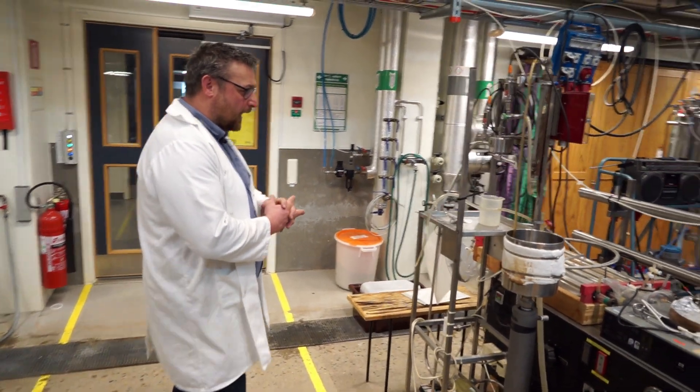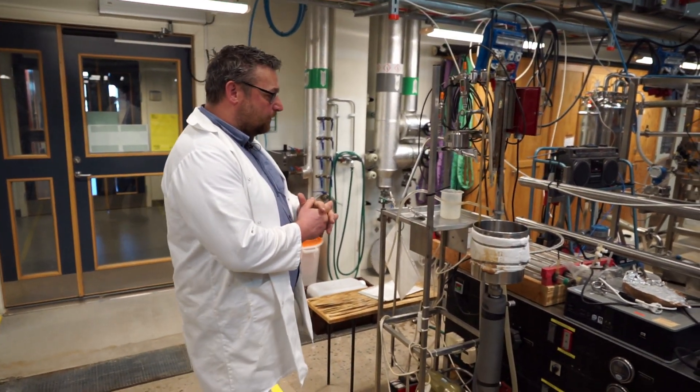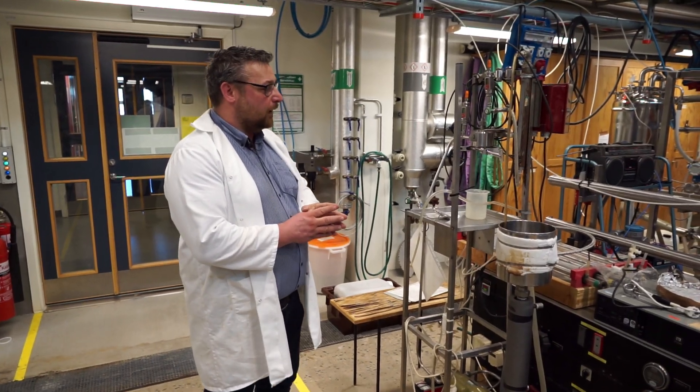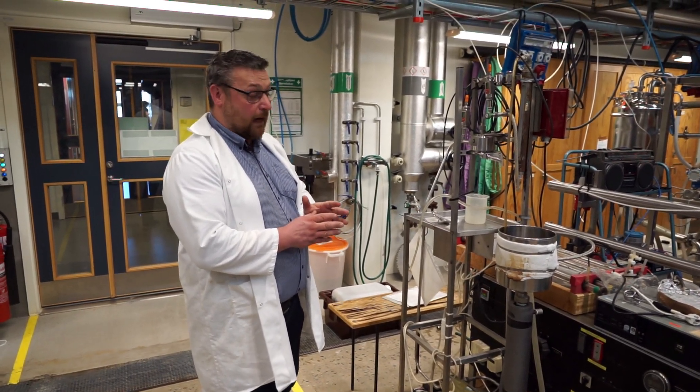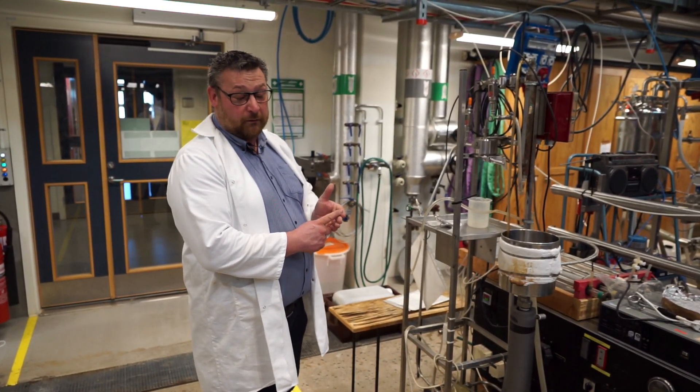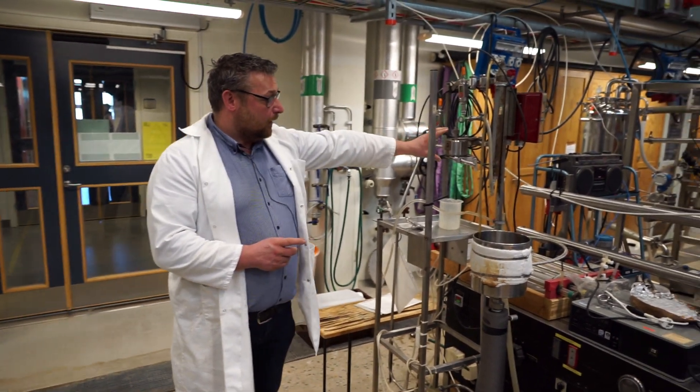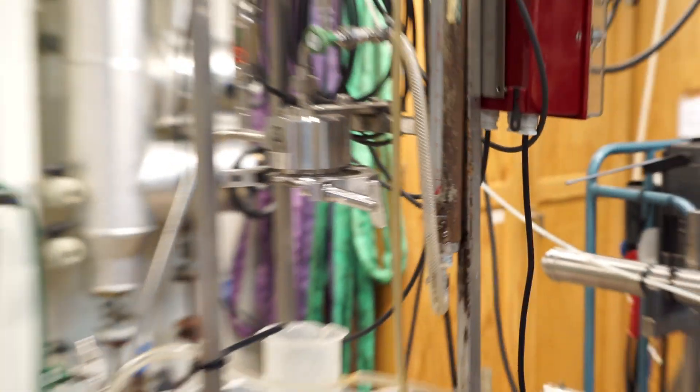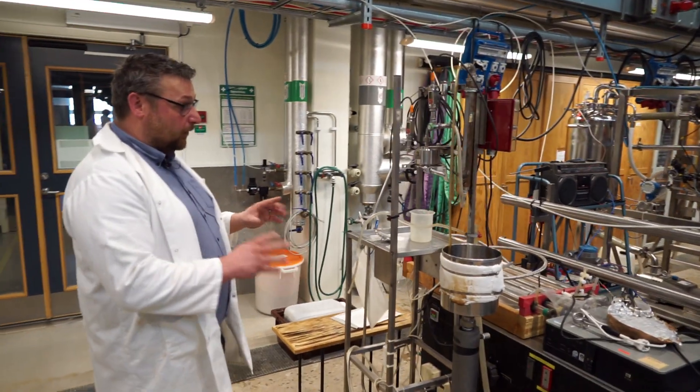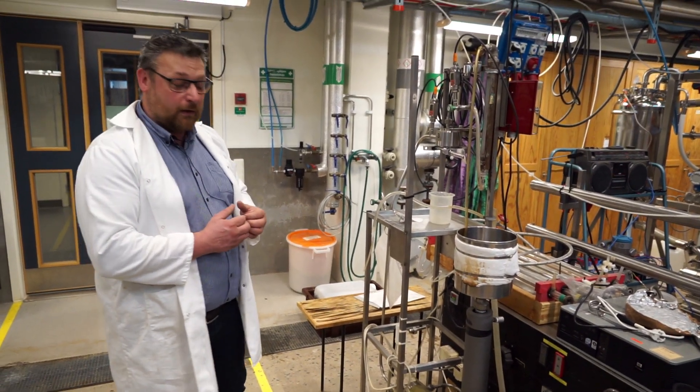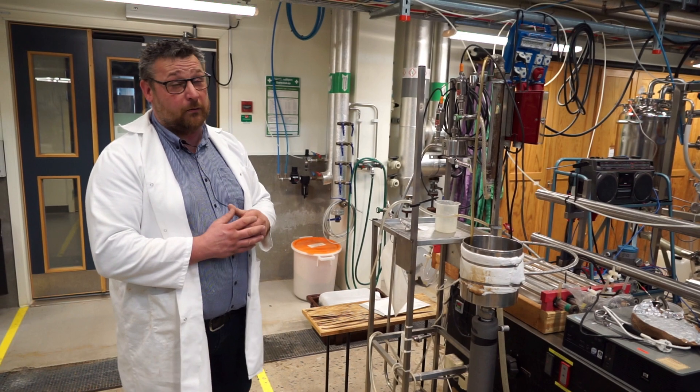Okay, so what is this equipment? This is a small membrane equipment that we can use to study actually both microfiltration, ultrafiltration, nanofiltration and reverse osmosis because this little membrane module can withstand a great variety of pressures. Right now it's set up for microfiltration because the pump in this system is not equipped for reverse osmosis.